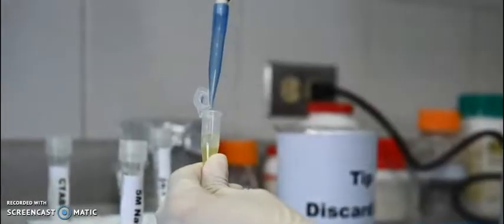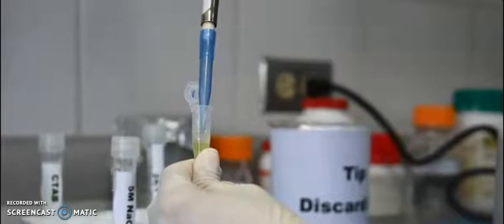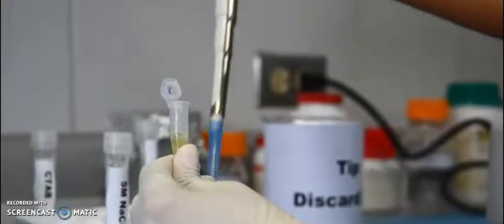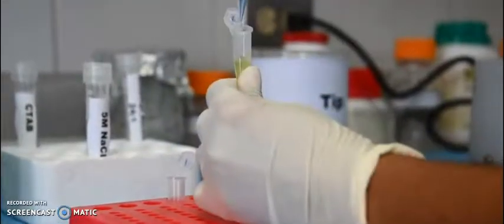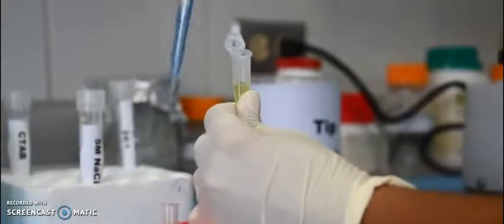Now transfer the aqueous layer to a clean tube. While transferring the aqueous layer, ensure that you are not disturbing the bottom layer.